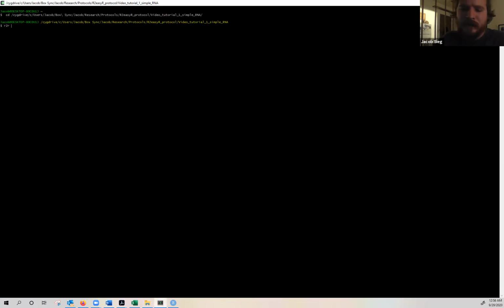I'm going to use disable usage warning. And that's because I don't want R2R to print the warning message that normally goes along with it. Normally, you're using this on consensus secondary structures, and we're not doing that, so we don't need to see that warning.